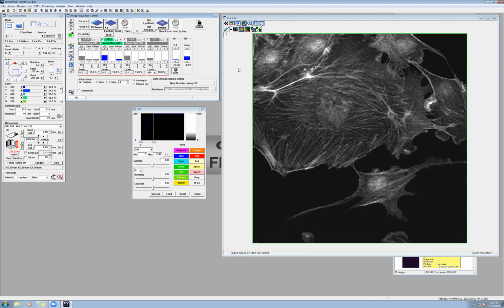So there are all these features of the software. At the end of the day, it's all about what is your question, right? Depending on the question that you have, the settings that you are using will change. If you ask me to tell you one setting which is the magic wand over here, the answer is there is no one setting which is a magic wand. The settings will change depending on the question that you have. All right. So again, when it comes to saturation, this is not saturated at all. So that's what we are looking at.